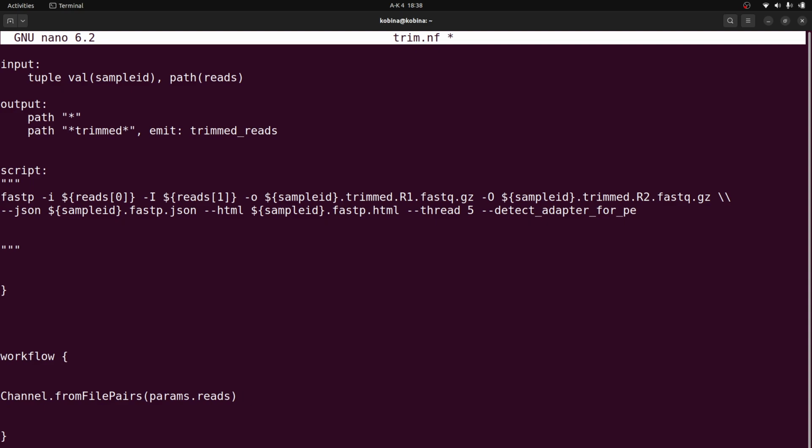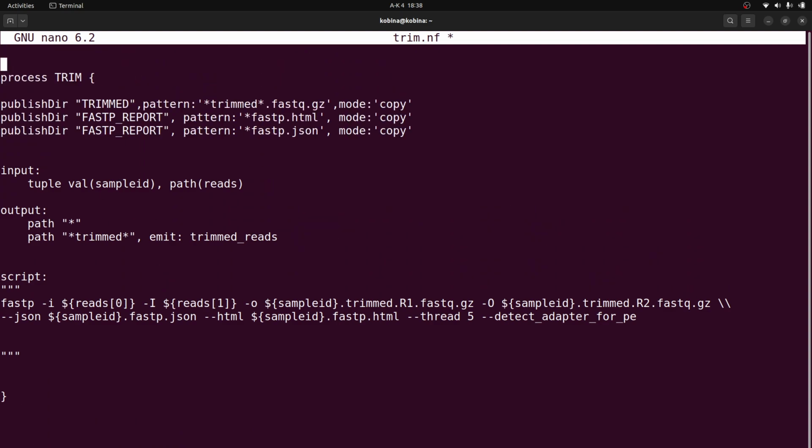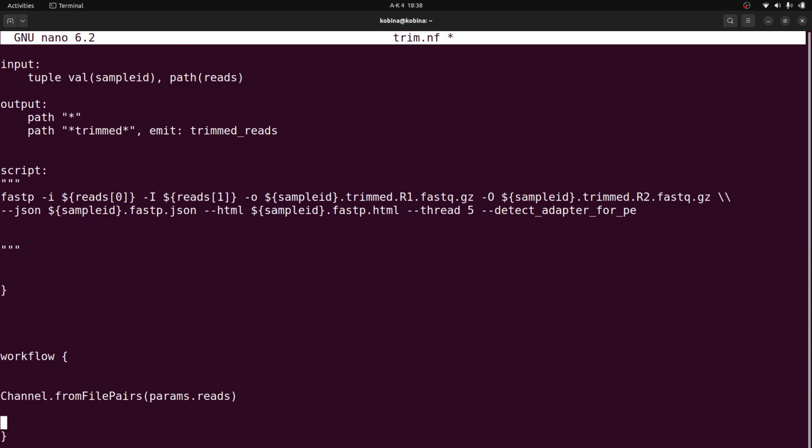Now, because we are going to supply this to the process trim, a simple way to do it is to bring a pipe and say trim. I can just close the space, that's fine. So we have a pipe character, and then we have trim. You can also just put the space, that's also fine. All right, so this one will work for you.